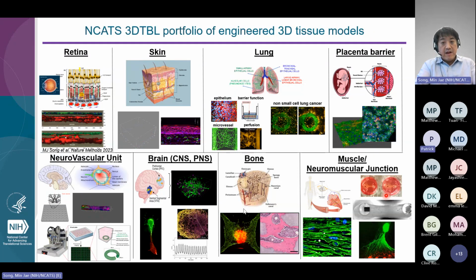And then finally, we developed the skeletal muscle model using a unique commercial platform, enabling the simultaneous measurement of contractility in a 24-well format. This model will be further applied to increase the complexity to achieve a neuromuscular junction model by introducing iPS-derived motor neurons, in collaboration with the NINDS. And eventually we will use this model for gene therapy applications and modeling rare diseases.